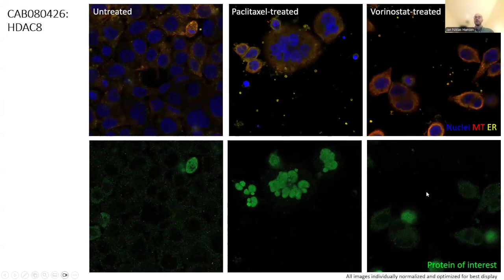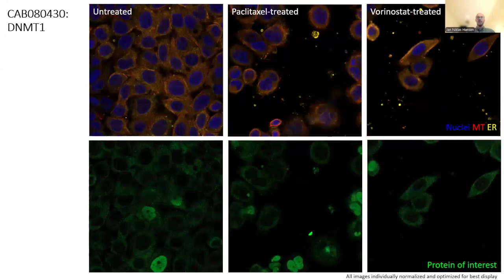And we also see it more like in untreated conditions in vorinostat treated cells. Here we have a protein, DNMT1, which shows large spatial-temporal heterogeneity, or we assume spatial-temporal heterogeneity based on the intensity variation that we see in the three conditions. And there might be changes here as well.